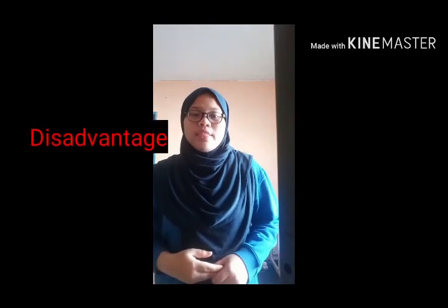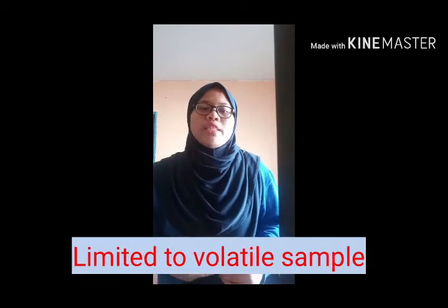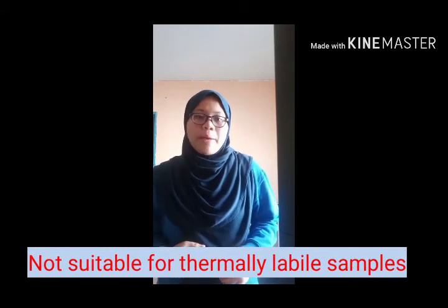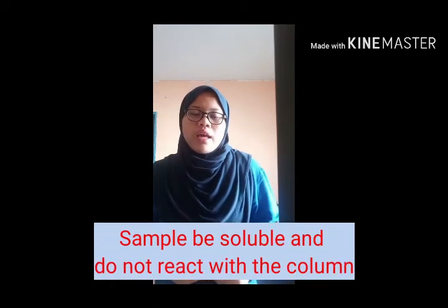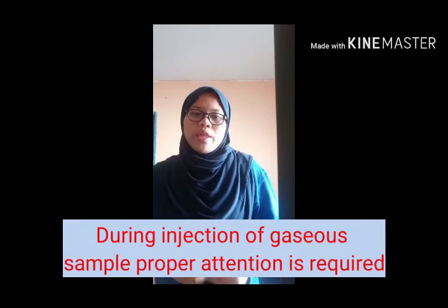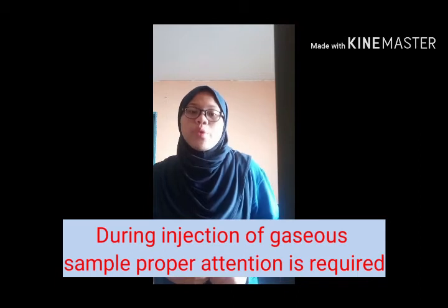While the disadvantages of gas chromatography are, first, it is limited to volatile samples. Next, it is not suitable for thermally labile samples. Then the sample must not react with the column. Last but not least, during injection of gases, proper attention is required.